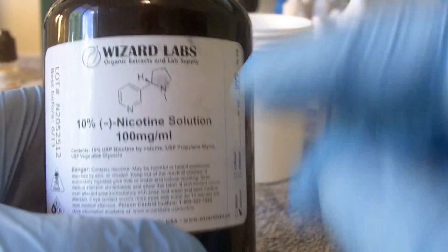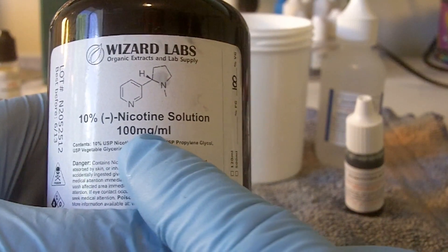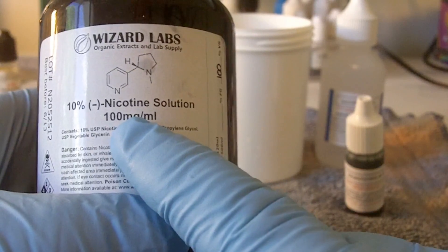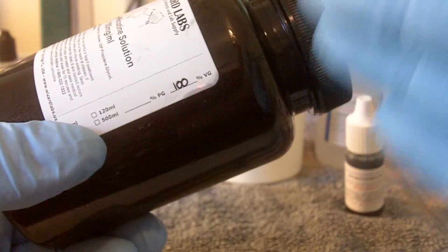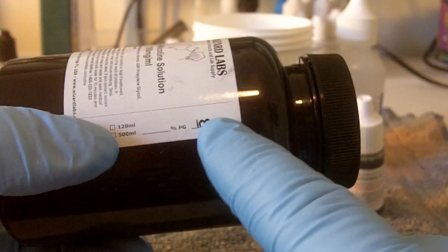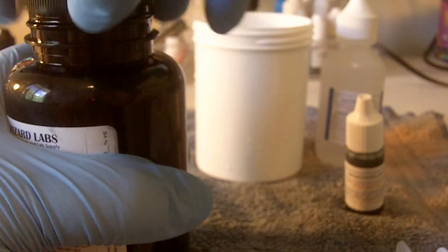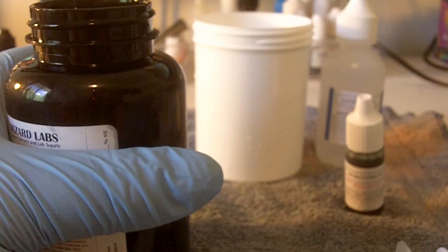To run this test, the first thing we need to do is take a look at this nicotine. This is from Wizard Labs — it's 100 milligrams per milliliter, which it should go without saying is incredibly dangerous. You want to be very careful, that's why I have these fancy gloves. You also want to keep it away from children and keep it in a safe, dark place. It's in a nice black opaque bottle. Mine happens to be 100% VG, so this stuff is really thick. To help measure this out, I'm going to use a syringe with a very big tip needle.